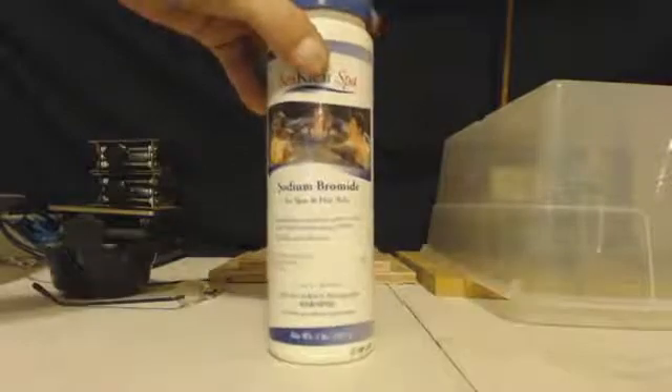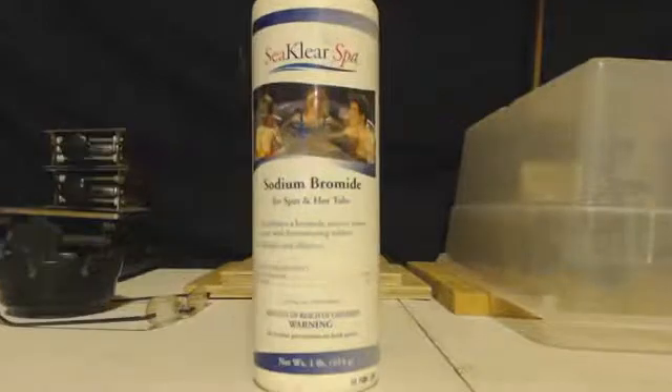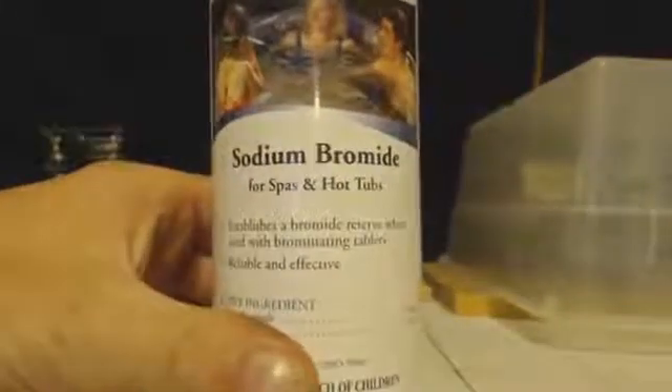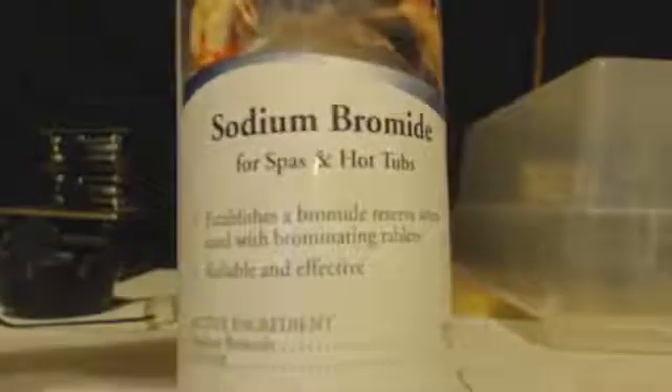This is John Black, super chemist, here to show you how to get some pure sodium bromide. Here's a package of the product — you can get this at any swimming pool place or spa place. It's for spas and sodium bromide.